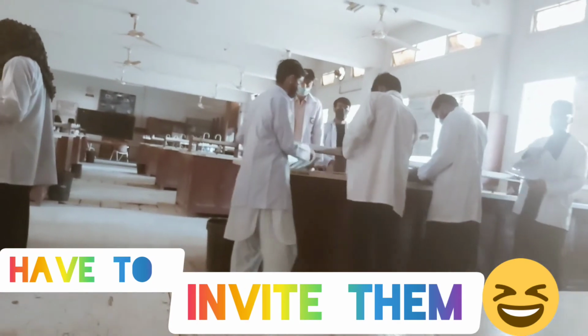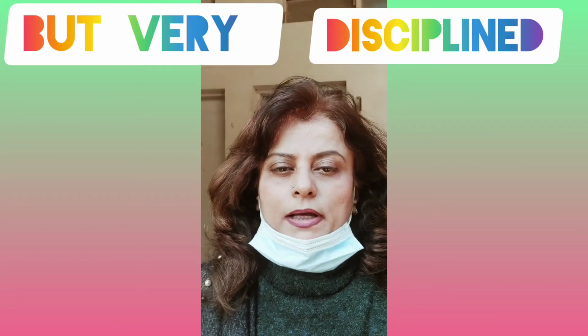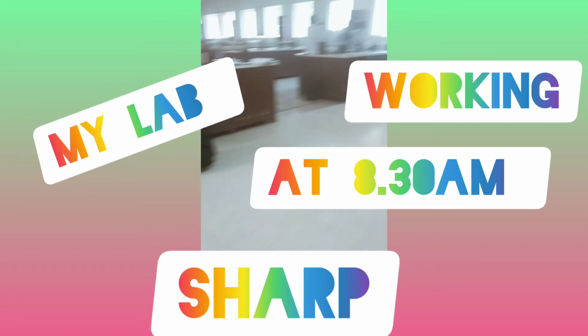So now I have explained them, now they are going to join. I have demonstrated the experiments today because it's a new group. They are new, so they need to understand everything from zero, from the very beginning. It took me almost 1 hour to explain everything, the first step of this experiment to identify the compound. So this is how they are doing right now. I can show you. The students are standing here and they are waiting for their compounds.